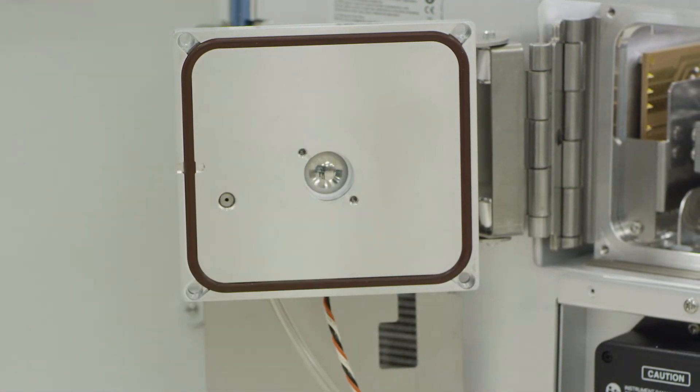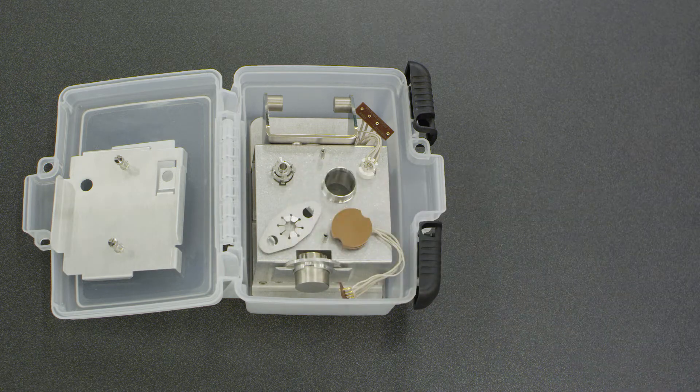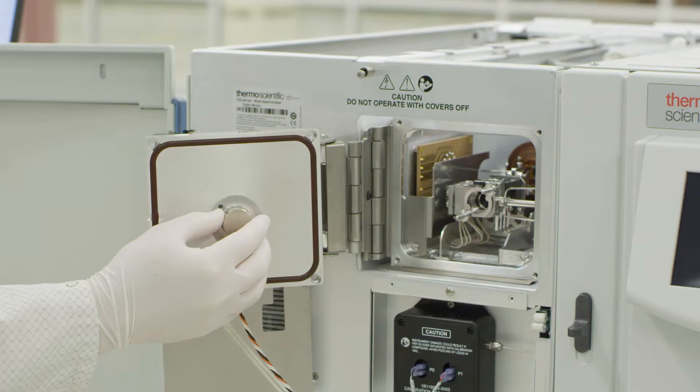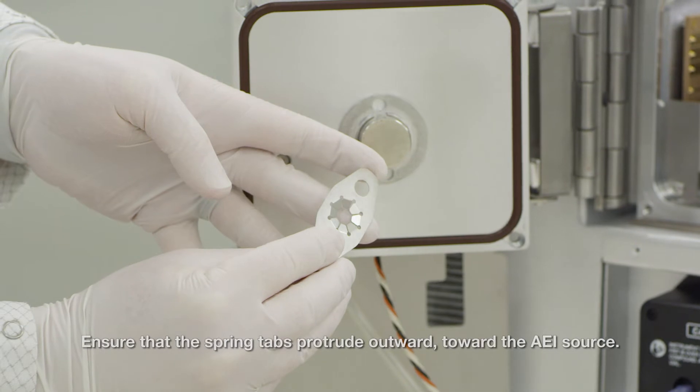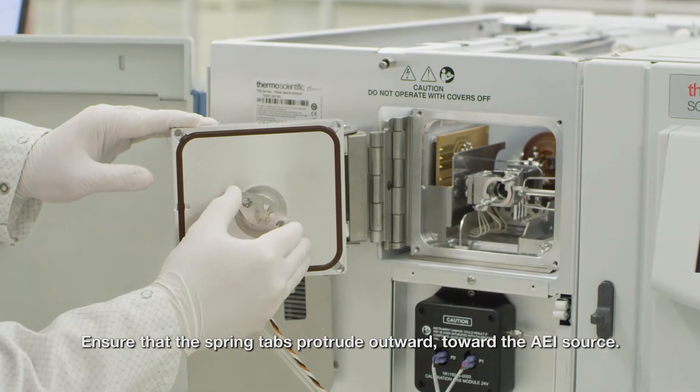Remove the collar and place it into the source box. Install the AEI source magnet assembly with the spring tabs bent out facing the source onto the inside of the front door of the manifold.